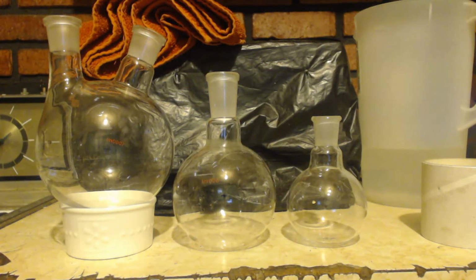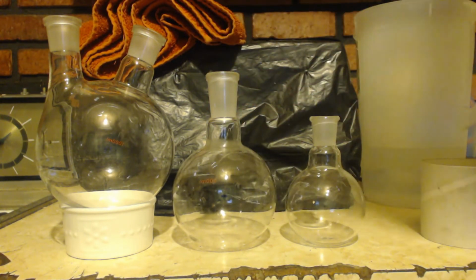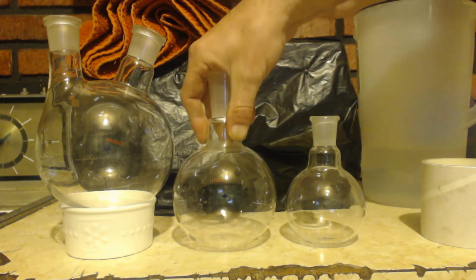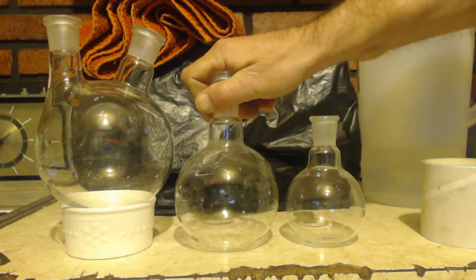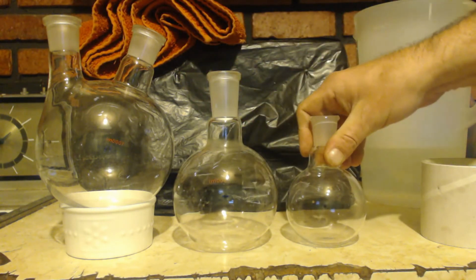These two tips are really good. The first tip is if you buy round bottom flasks, like I said in another video, get the fused silica or fused quartz. Some people call it one, some people call it the other. That's really making your glass 100 million times better. This is a good suggestion here too.